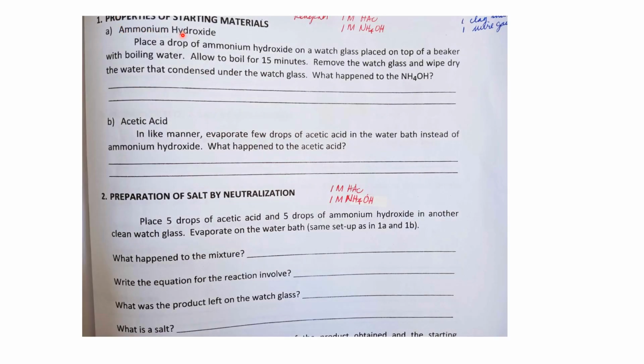Part 1 of the experiment is about properties of starting materials, where the starting materials that we are talking about are ammonium hydroxide and acetic acid. The setup involves placing the material on a watch glass, which in turn is placed on top of a beaker with boiling water. Now, since ammonium hydroxide and acetic acid are volatile materials, then after the heating period of about 5 to 15 minutes, nothing is left on the watch glass.